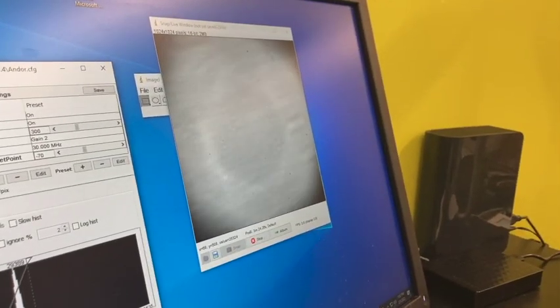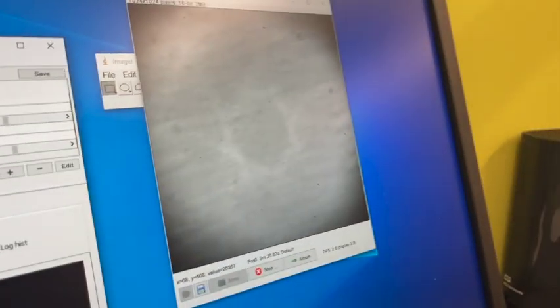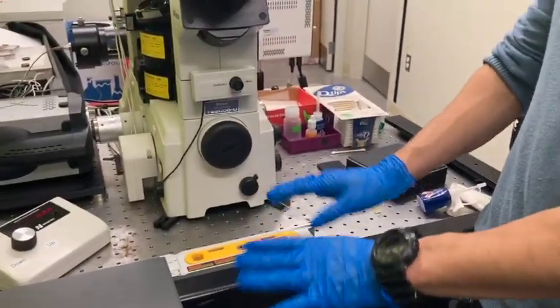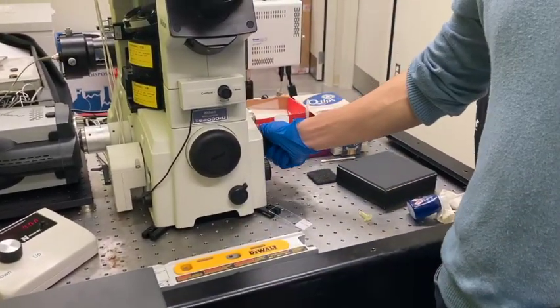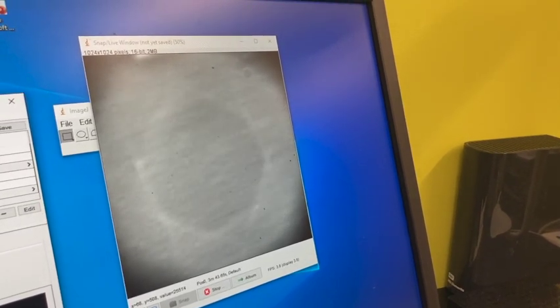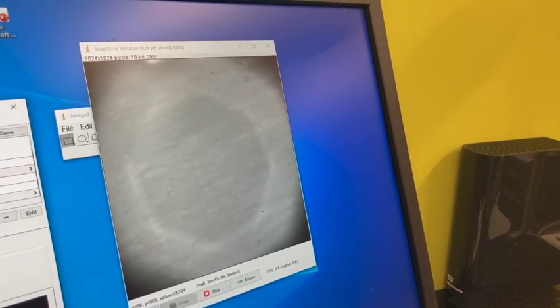It was really hard to find a surface in this system, but right now it is better. So if you push the objective down to the floor and then start to go up, and then if you go to that screen, as you're going up, you will see a hexagon expand from the center, which means you are approaching the surface.